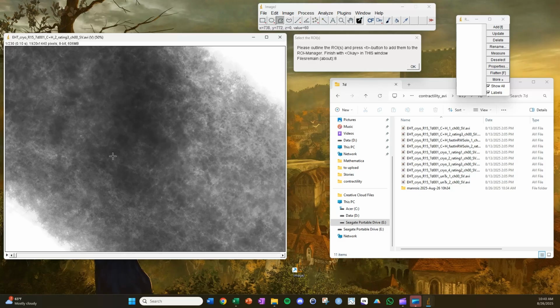And something that might be helpful to do when taking these videos, something I did, is that I wrote, you'll see here, I wrote "rating 3" in the label. That's my notation for the fact that this is not clear beating. In my system, a rating of 4 would be clear beating. I didn't bother writing rating 4 on the other videos, it's just kind of implicit. But rating 3 here is a signal that I might have to look more in depth to see any beating. So if I play the video, it's probably not as obvious as before, which makes selecting the reference frame to draw this region of interest not so important, but we should still do it in a consistent way.